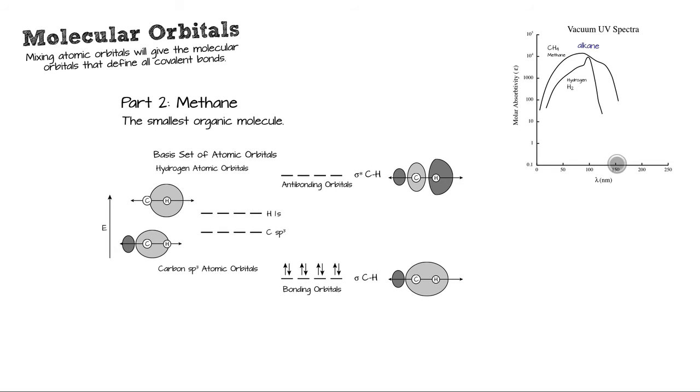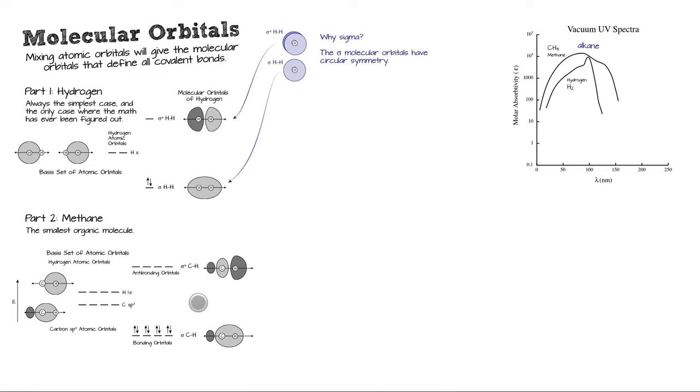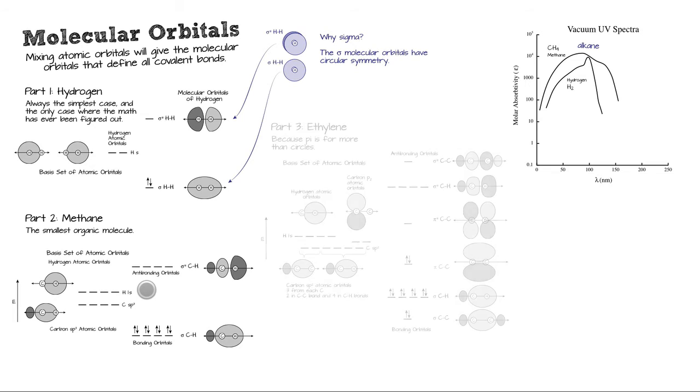Now, I can guarantee you we do not have an instrument that can look at 150 nanometers. I have a pretty good UV. It's super excellent, but it will not look down at 150 nanometers. And really it's pointless to even try because the atmosphere in your instrument is going to absorb light at that wavelength. So everything's going to look dark. So that is the sigma orbitals of methane.